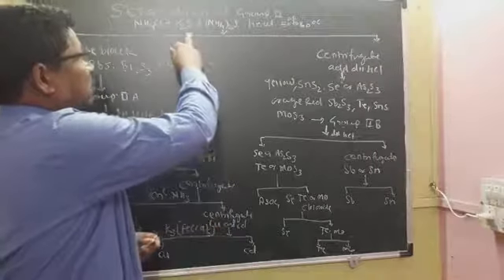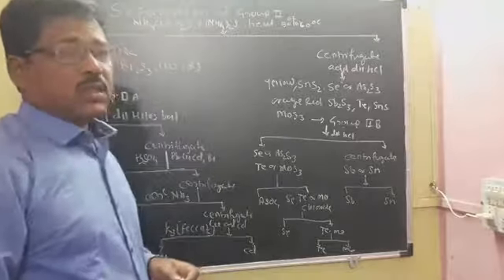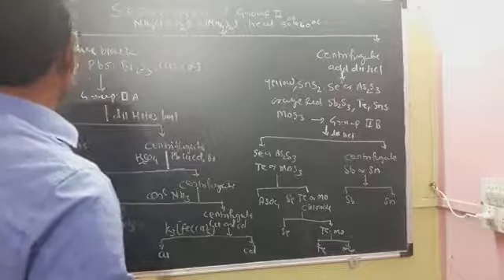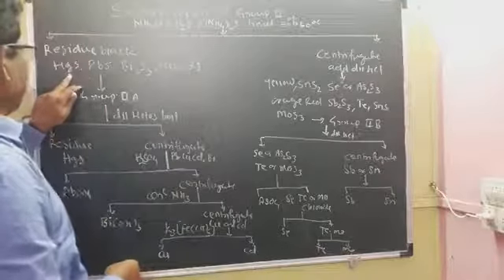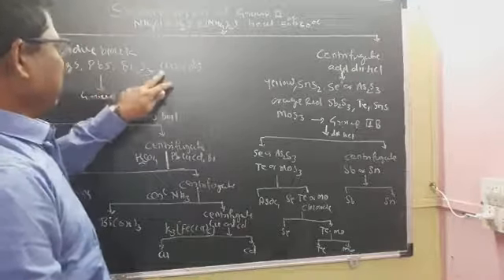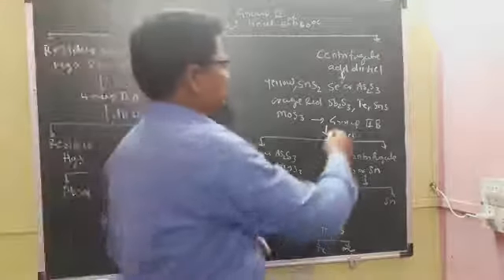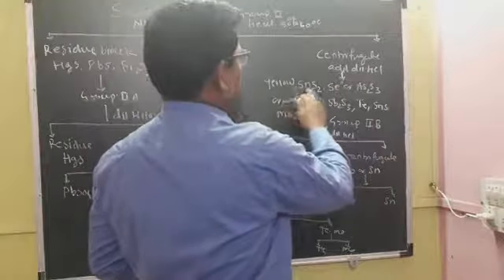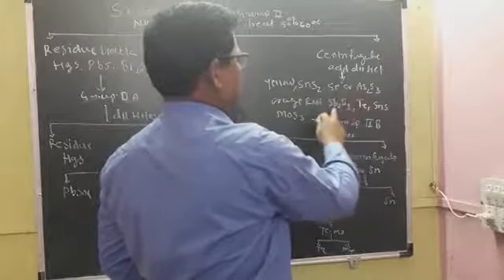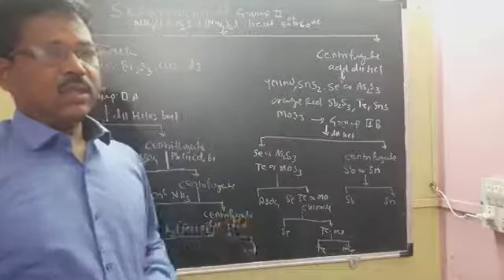Treat with H2S and ammonium polysulfide and heat up to 50 to 60 degrees Celsius, to get the black residues: mercury sulfide, lead sulfide, bismuth sulfide, copper sulfide, and cadmium sulfide. The centrifugate contains tin, selenium, arsenic, antimony, and tellurium. These elements are present in the centrifugate.